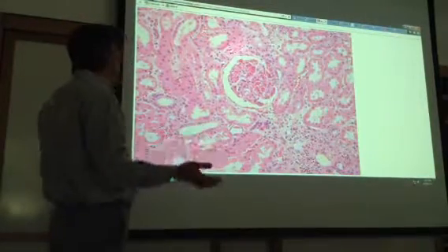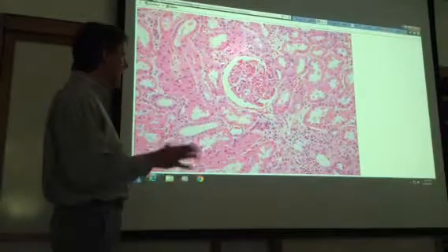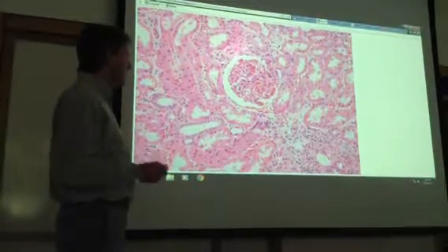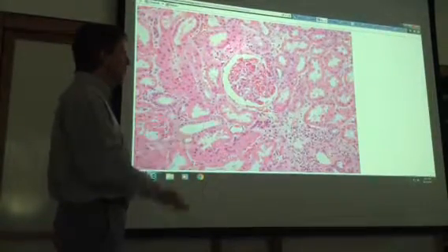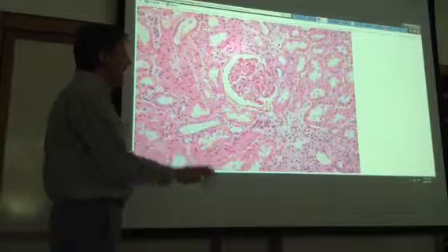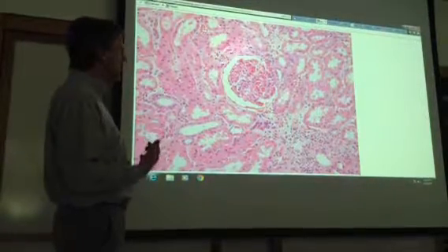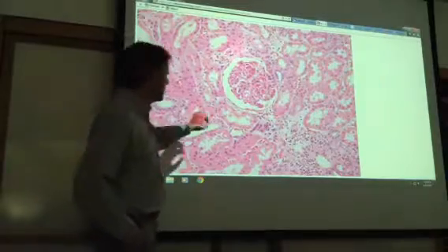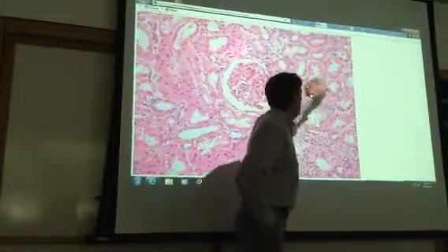What does that mean? Why should you care? Well, when you make the microscope slides, the inside of proximal convoluted tubules tends to be sort of cloudy as all of those microvilli dissolve or disintegrate. They kind of fill up the lumen. So if the inside lumen part is not clear, like if it's got a bunch of stuff in it, it's going to be proximal convoluted tubule.